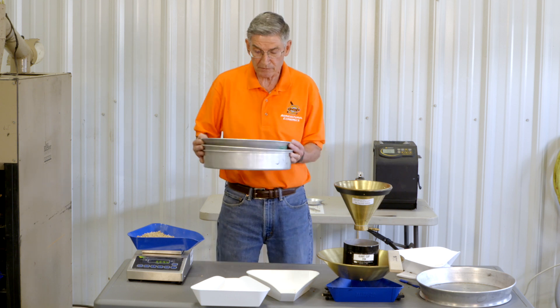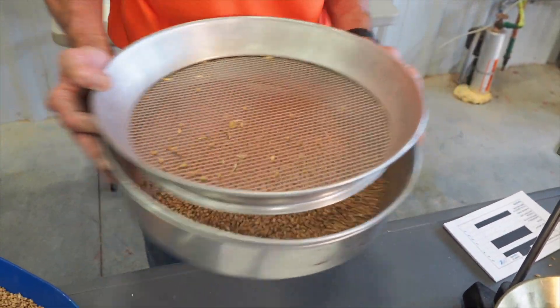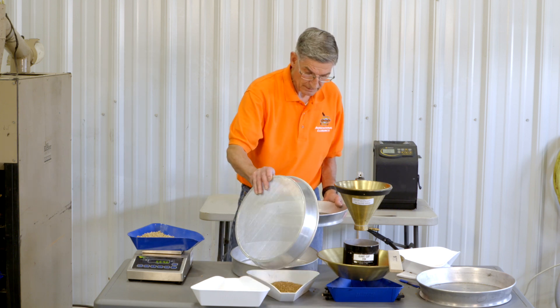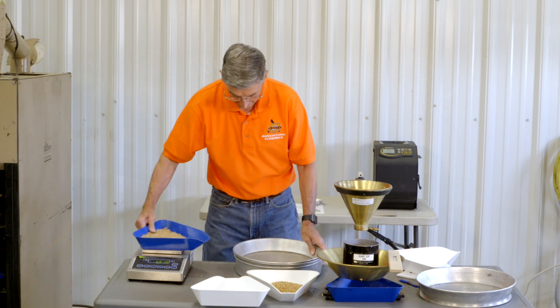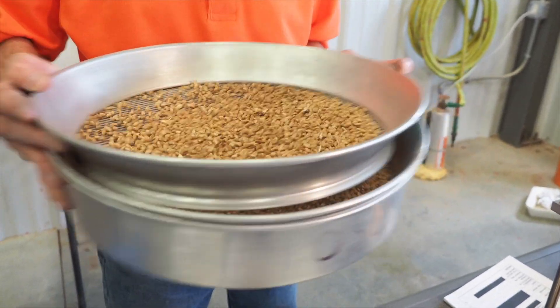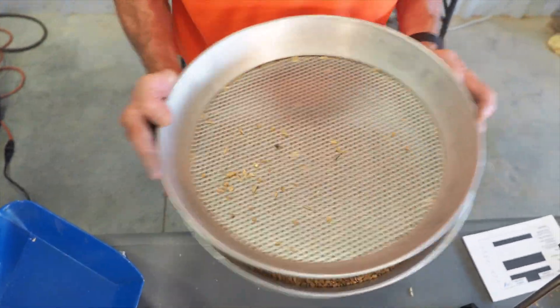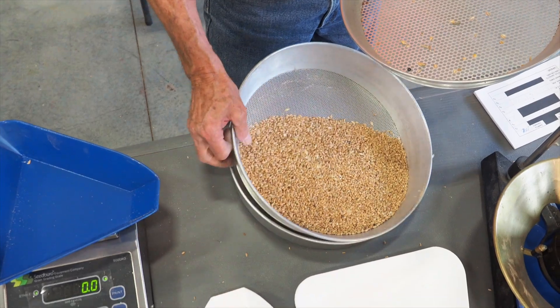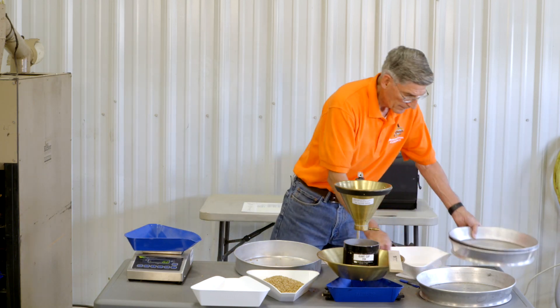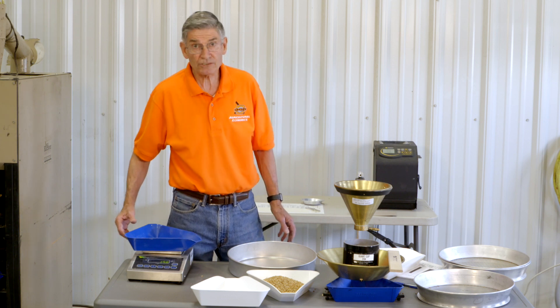Hold the top pan up so that the wheat can clear and fall into the bottom pan. Shake it till everything clears the top, and you've got your clean wheat and your dockage. I'm going to weigh out the dockage, and I've got 5.2 grams, or right at 2% dockage.